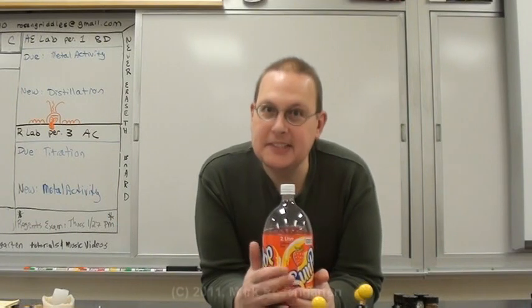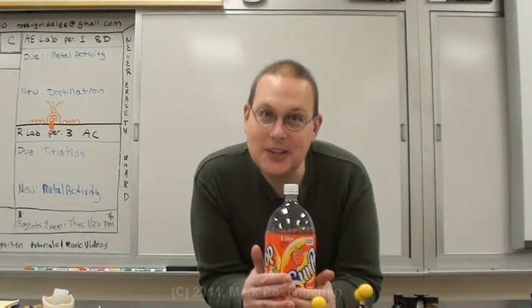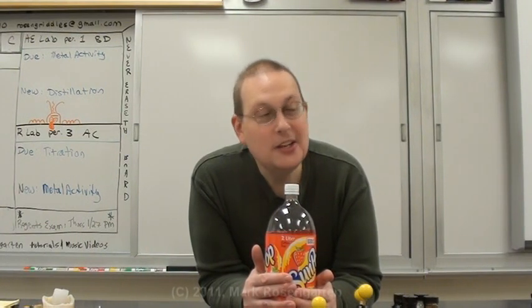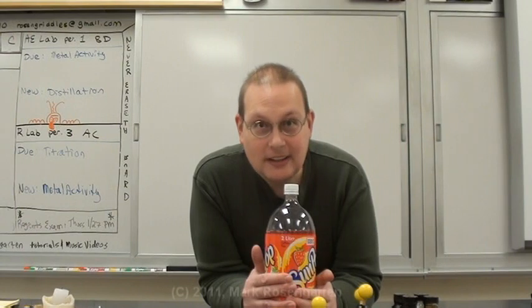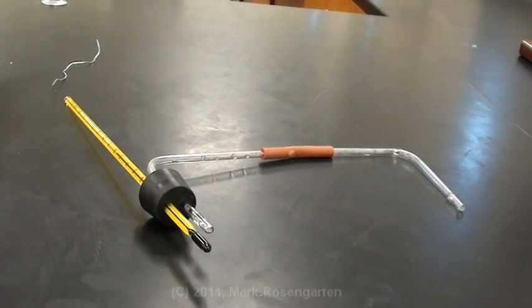And the component of this that has the next highest boiling point, well, you're just going to have to figure that one out for yourselves. You're going to collect it in a test tube, you're going to take a look at its appearance, you're going to take a look at its boiling point, and you'll be able to determine what the substance is based on just those observations.